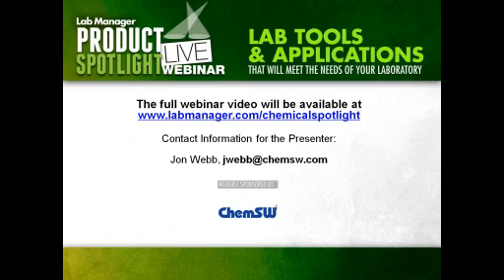Within a laboratory, you can drill down to maybe the lab level, a storage cabinet, a shelf, a specific bin. But our best practice workflow recommendation is keeping it at the lab level and maybe one layer beneath the lab level.